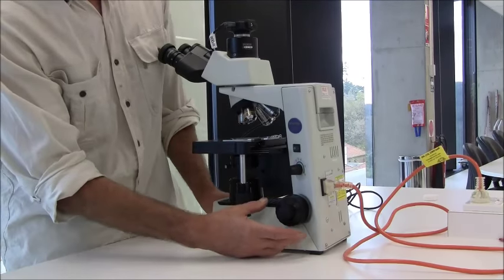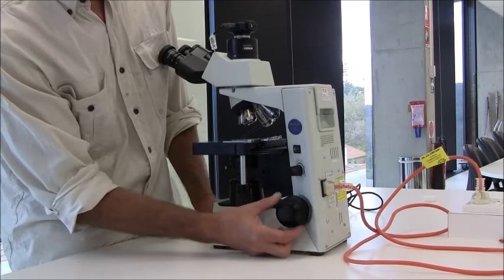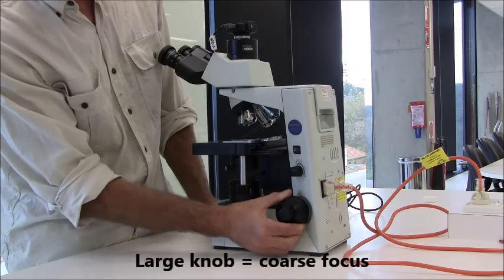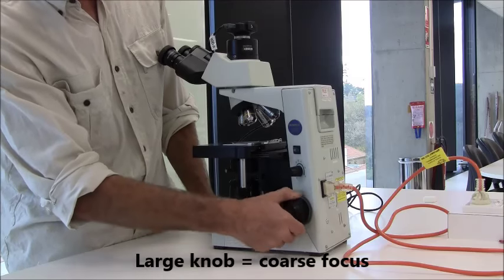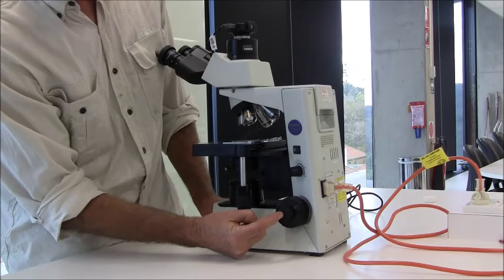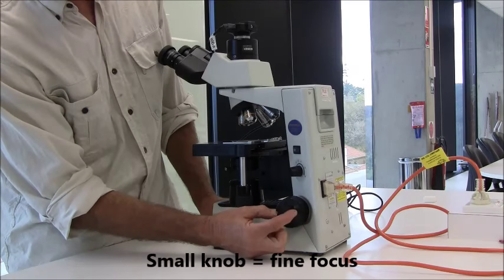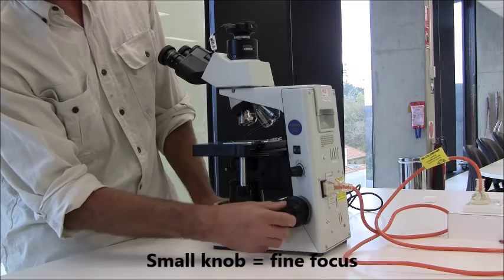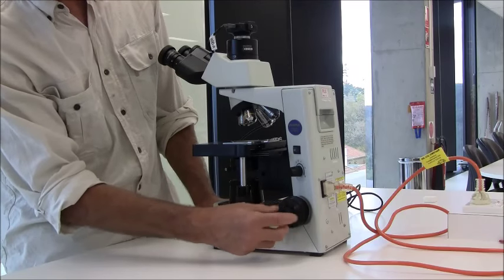There are two focus knobs. The larger knob on the outside is the coarse focus — when you move that, there's a lot of movement in the stage. On the inside of that larger knob is a smaller knob, and that's the fine focus. You can rotate that quite a lot and you don't see any movement in the stage at all.